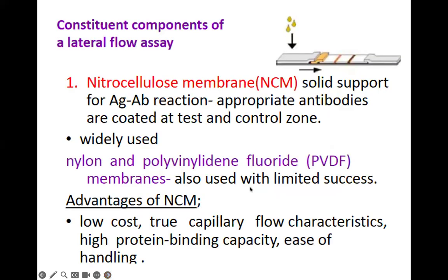So coming back to the architecture of the lateral flow, okay? So the padding, the solid support, there are certain different types. For example, we have the commonly used nitrocellulose membrane, okay? And as I mentioned, they have different porosity. So you have to characterize to suit the characteristics of your sample. Some samples might be very viscous, some might be very thin, or some require filtration.